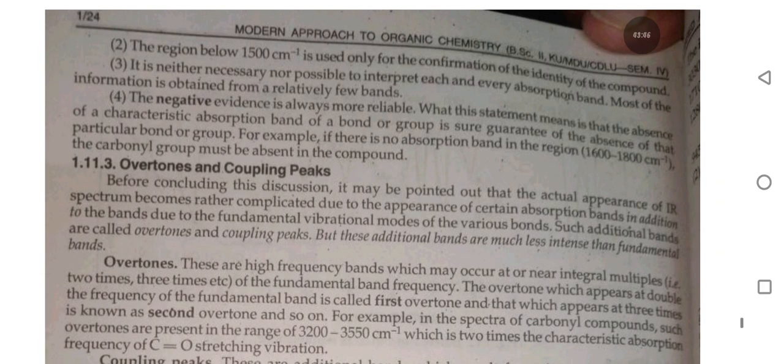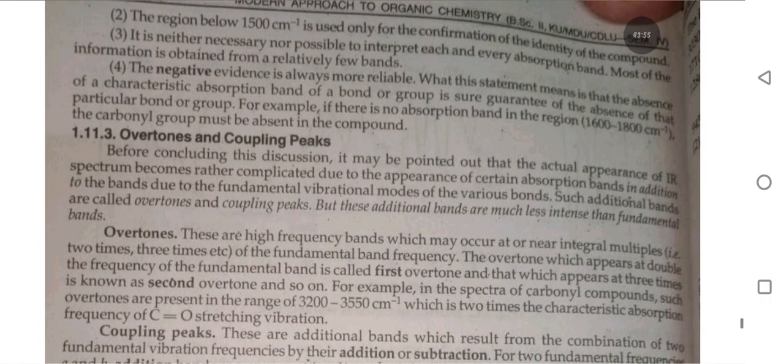Interpreting the infrared spectrum. The following points should prove very helpful in the interpretation of an infrared spectrum. Always start with the high frequency end of the spectrum. The absorption bands due to most of the stretching vibrations appear in the region above 1500 cm⁻¹. The region below 1500 cm⁻¹ is used only for confirmation of the identity of the compound. It is neither necessary nor possible to interpret each and every absorption band. Most of the information is obtained from relatively few bands.